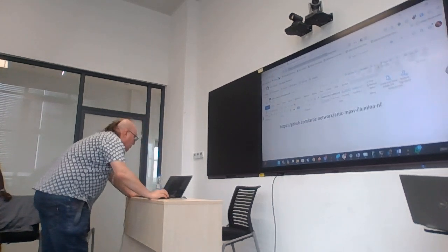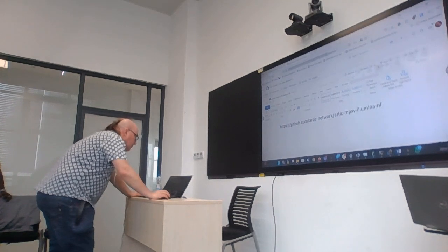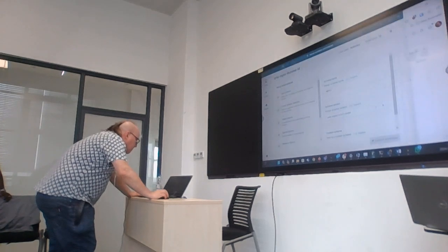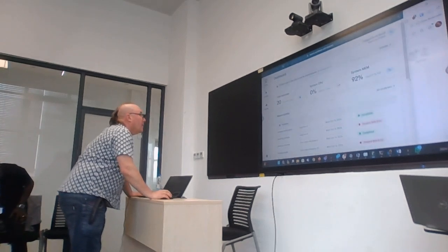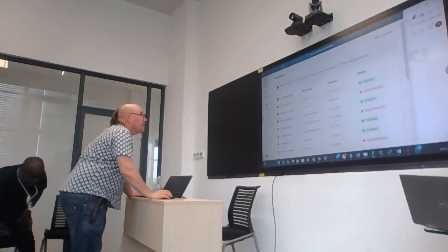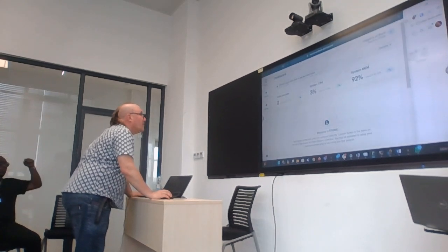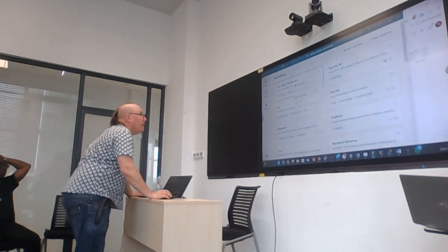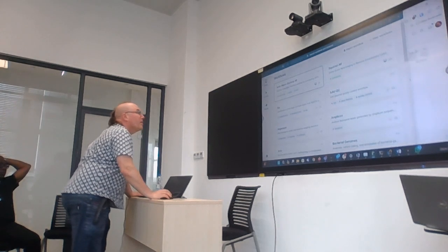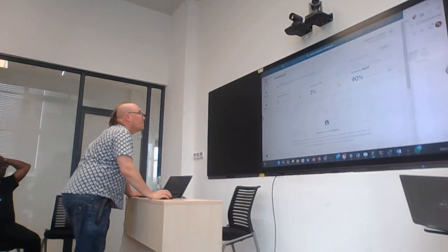I'm just going to delete my workflow and bring it back. Hang on, there's Epi2Me there. I just need to do something on my side so that I'm in the same situation. I'm going to delete the things that I've currently got, so that I'm in the same position as other people. How do I delete this? I can't delete it. Oh, they already have this link? Okay, sorry.